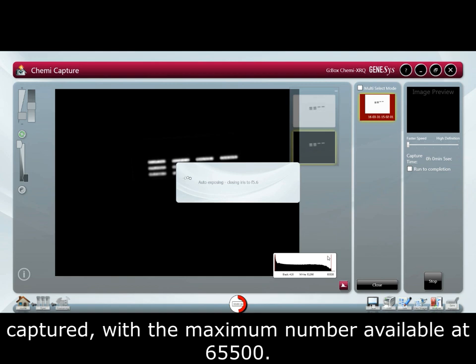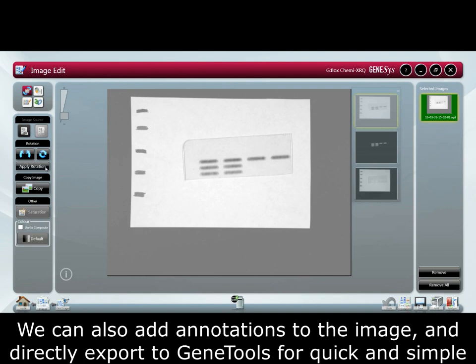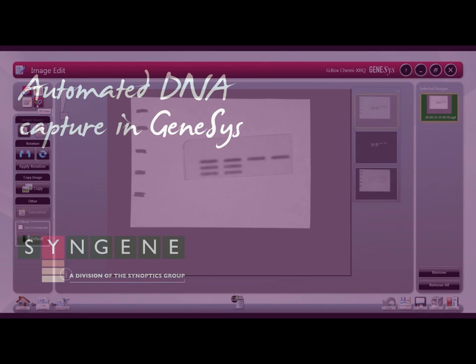The protocol can be saved to the home screen to save time when setting up future samples. The histogram shows the level of grayscale captured, with the maximum number available at 65 and a half thousand. We can also add annotations to the image and directly export to Gene Tools for quick and simple quantification of your blot.